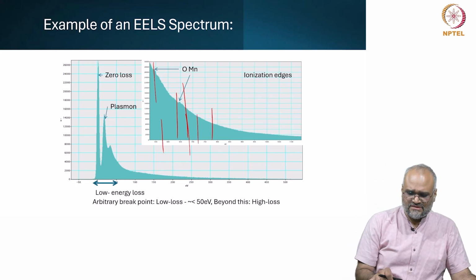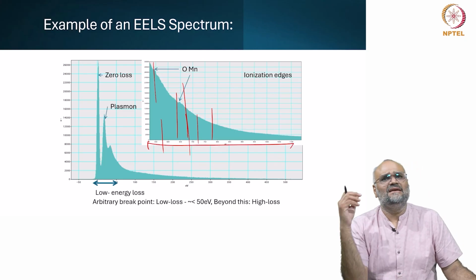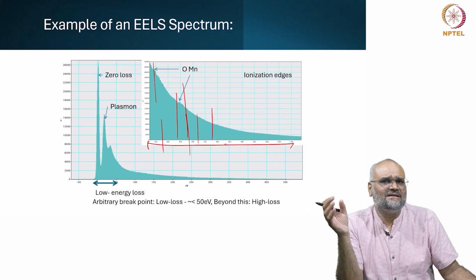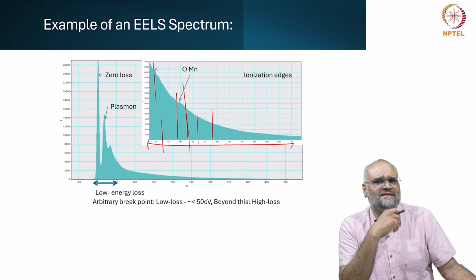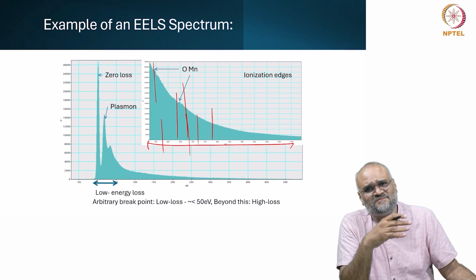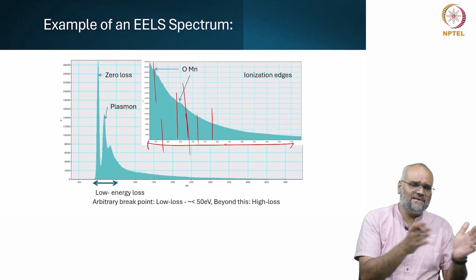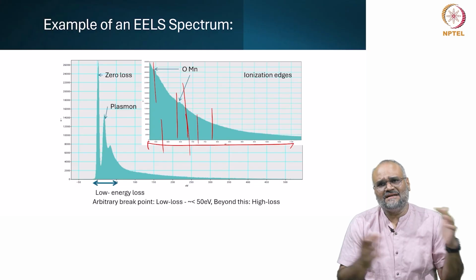So you can choose which range of energies you are dispersing on the spectrometer, and you can successively start collecting the data. I can also choose to do this in the spectral imaging that we collect for STEM EELS, and you can collect the entire window.